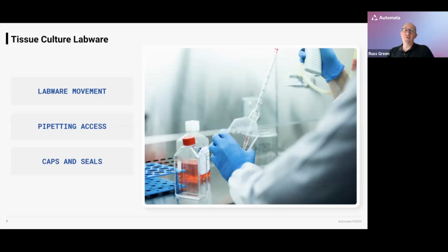But I'm going to question whether that is the right way of solving these challenges as we go through this content, because building automation that is really specific to a piece of labware, without considering whether we can change something to take advantage of all of the off-the-shelf devices that are out there that deal with other kinds of labware, seems a little bit short-sighted to me.